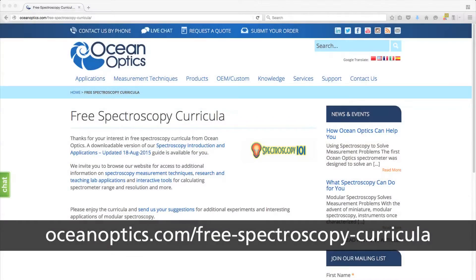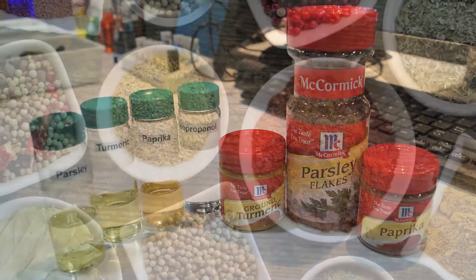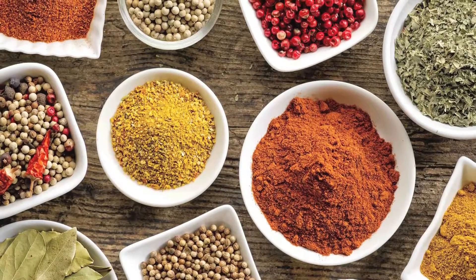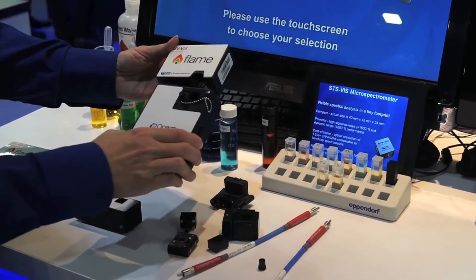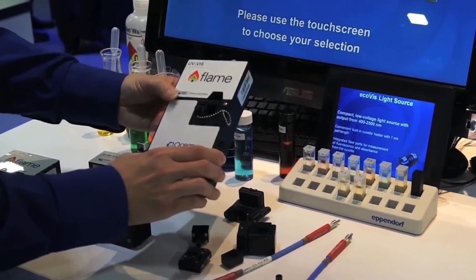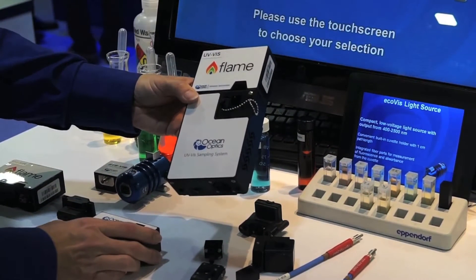Use our free spectroscopy curricula to get started quickly, or design your own. In our absorbance experiment on the characterization of spice extracts, students use a FlameChem spectrometer system to measure various spice solutions at visible wavelengths. The FlameChem system is robust and simple to use. It includes our standard Flame spectrometer and a direct-attached light source integrated with a cuvette holder.